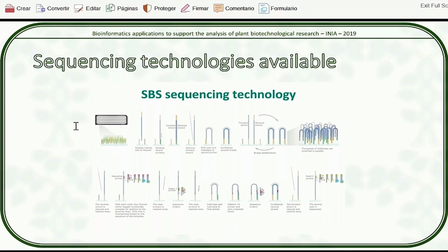Why? I'm going to explain that later in the algorithms, but basically, the smaller the insert size, the smaller the template, the more difficult it's going to be to solve the repeats. Therefore, the repeats are going to be collapsed, and the assembly is going to be more fragmented. We're going to see that when we see the algorithms. But basically, first you choose an insert size.